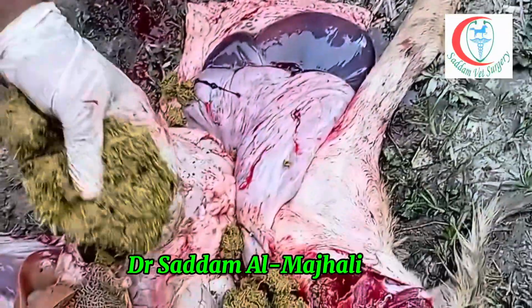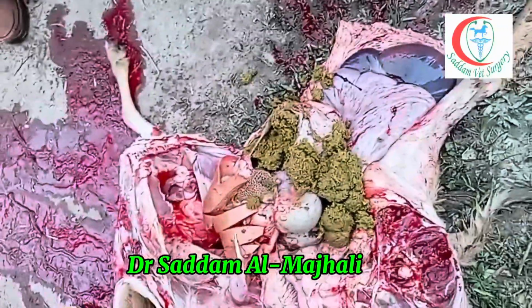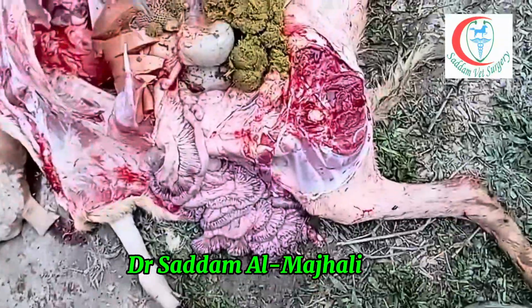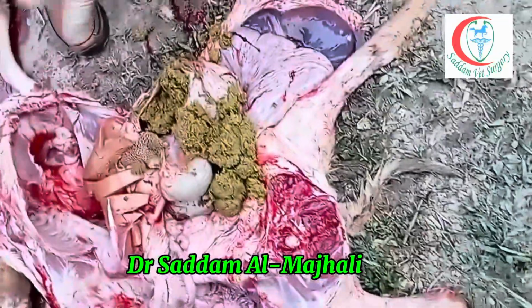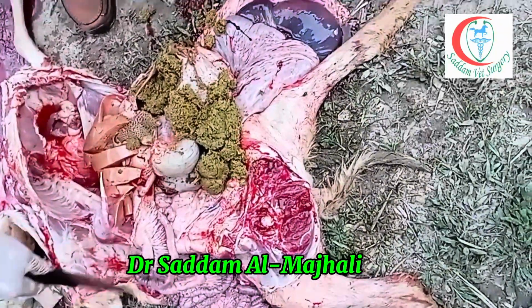Not much, but the problem is because she is pregnant too, she got toxemia. Oh, yeah. Toxemia and this problem, no absorption. So the reticulum empty, no rumination, no adding. If she adds food, she will ruminate. This one should be full. Then this one should be full, but empty or congestion.